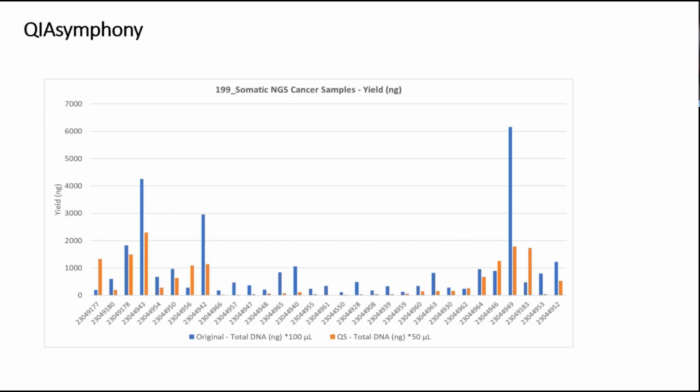However, one of the things that we did notice is, particularly with the smaller samples, because this is an automated machine, you often do see some reductions in yield, and a lot of those smaller samples that we get, we actually saw a reduction in the amount of material. We still got that increased quality, but we were seeing this lower amount, and we felt that for those smaller samples, this could have a significant impact on whether we'd be able to go on and test them.